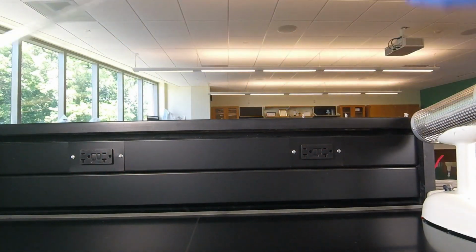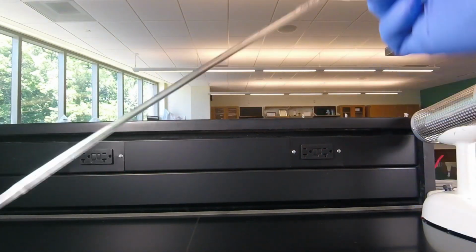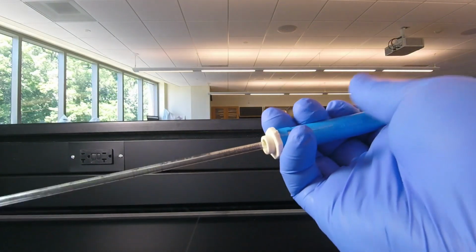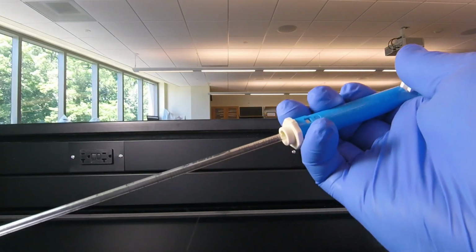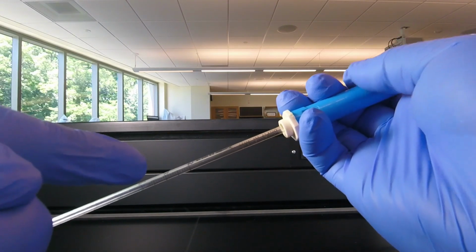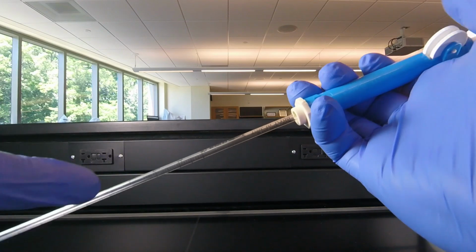So when we're ready to do our pipetting, we would put the pipette into the liquid, and then we would turn the knob downwards to suck the liquid up into the pipette, watching it rise, and then turn it the other way to dispense it.